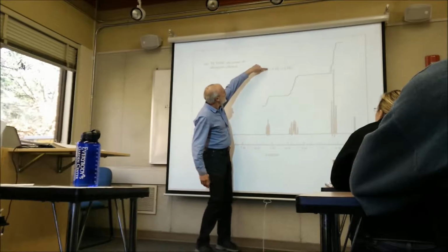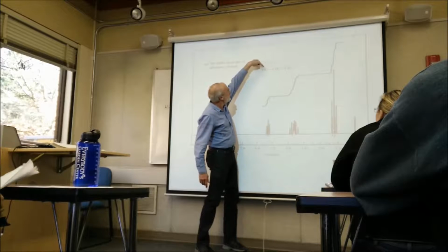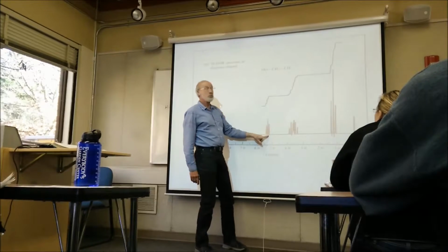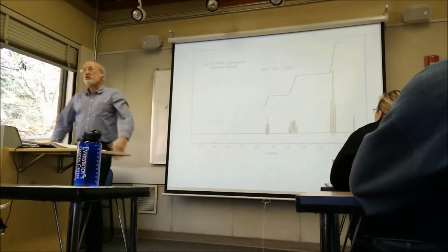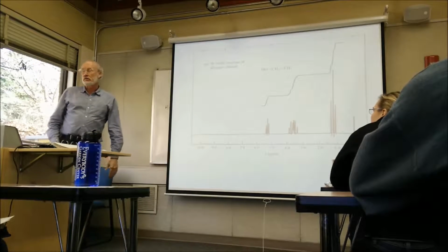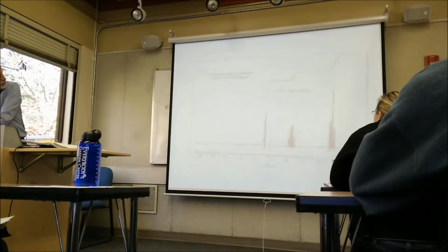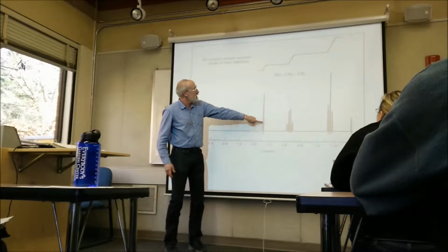Here's the hydrogen on the oxygen, and you notice that there are two hydrogens on the carbon next door, so you expect this to be split into a triplet. And there it is, split into a triplet. Now, this is ultra pure ethanol. If you just take common ethanol out of a container, which has very small amounts of acid or base impurities, notice that the splitting here is gone.